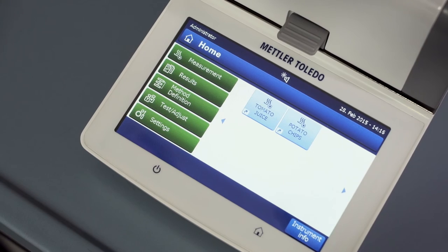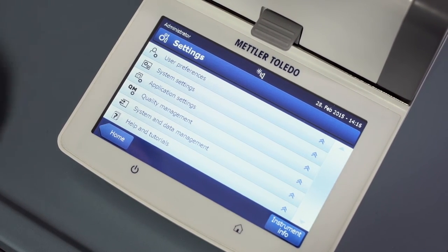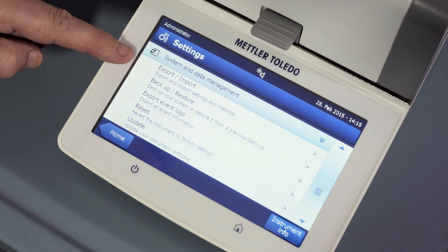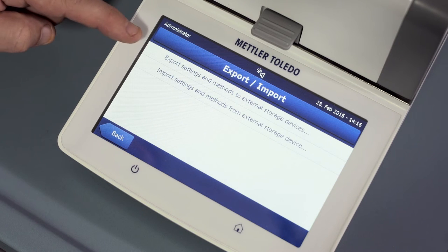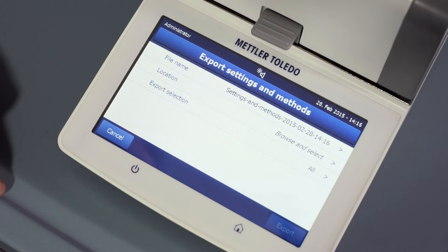To do this, go to settings, system and data management, and their export import, and select export settings and methods to external storage devices.